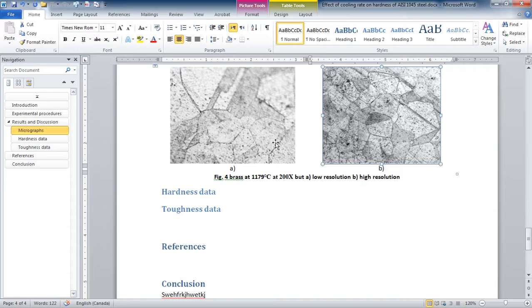What does that mean? Imagine that you have this view field in front of you, which measures 2000 pixels, let's just say. The image on the right has taken all of that 2000 pixels, right? The image on the left is taking only some part of it from the center.